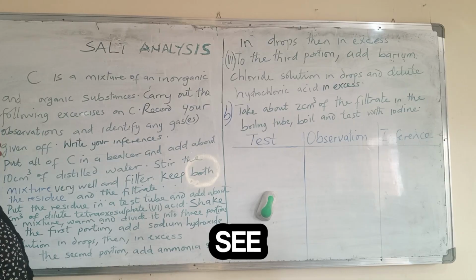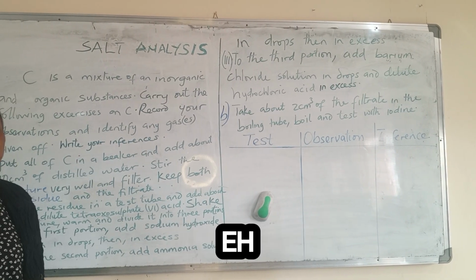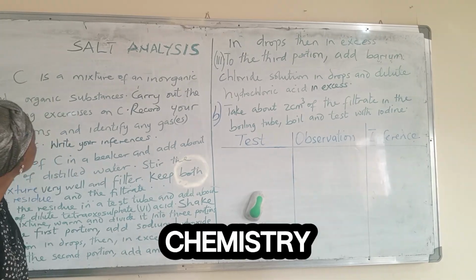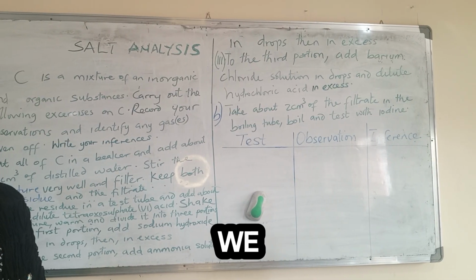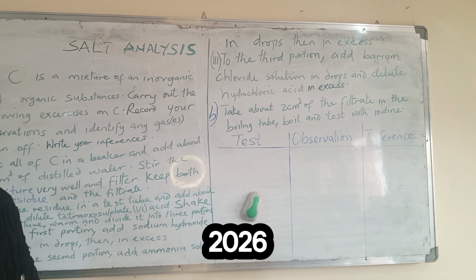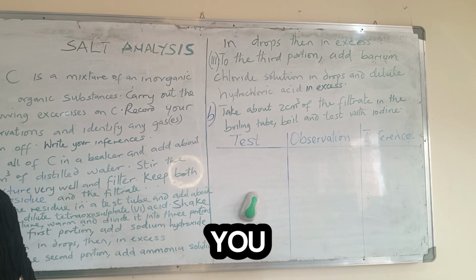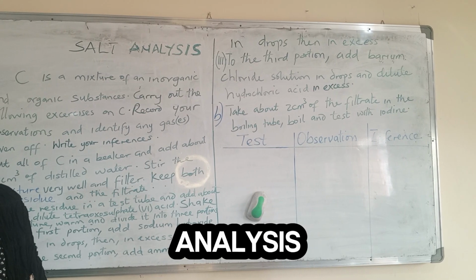Today we have to do salt analysis for the 2026 chemistry practical that we think we need to prepare you for. You have to be prepared for the 2026 WAEC chemistry practical. So today we shall be taking you through salt analysis, which is qualitative analysis.